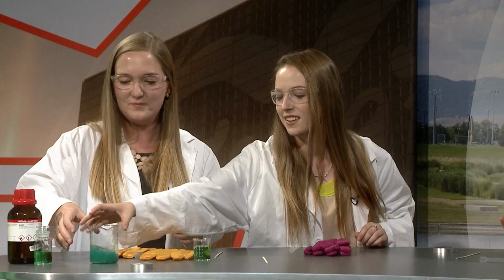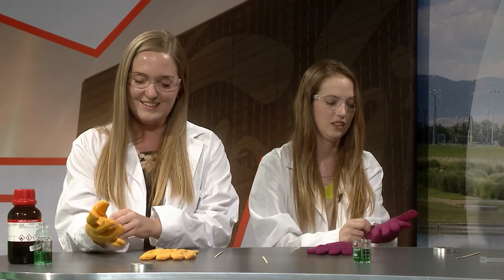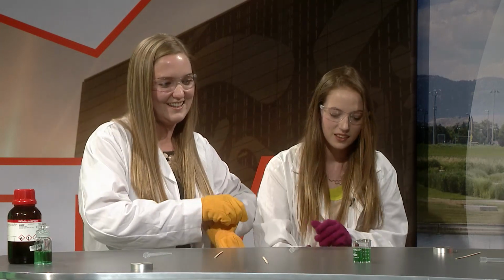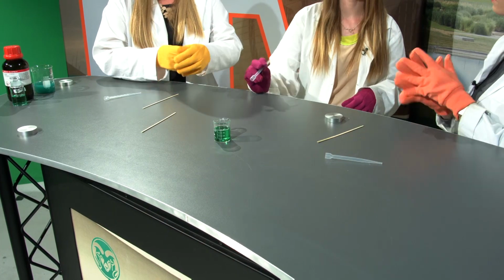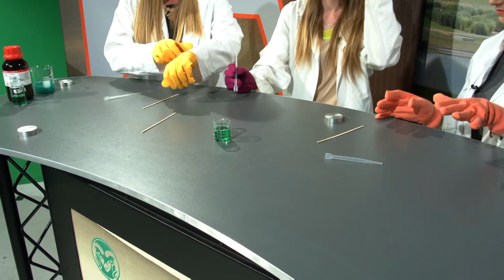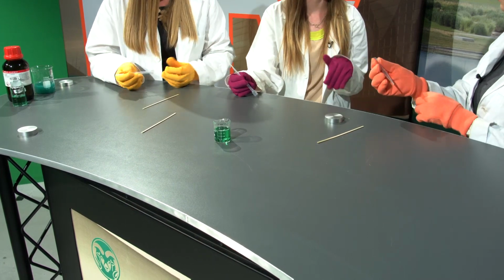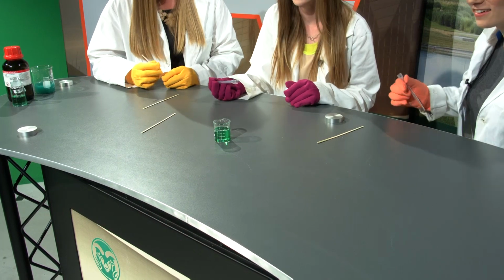Awesome. Cool. So should we do the bubbles? Bubbles? Yes, absolutely. This bubbles one is so super fun. Okay. Put on your gloves. Here we got fun colored gloves. So these gloves are 100% cotton, because that works the best with the bubbles. Also, the sleeves of your lab coat work really well. Yes, also that. But if it touches your skin or your hair or something, it will pop. Okay. I'll try not to let it touch my skin or hair.